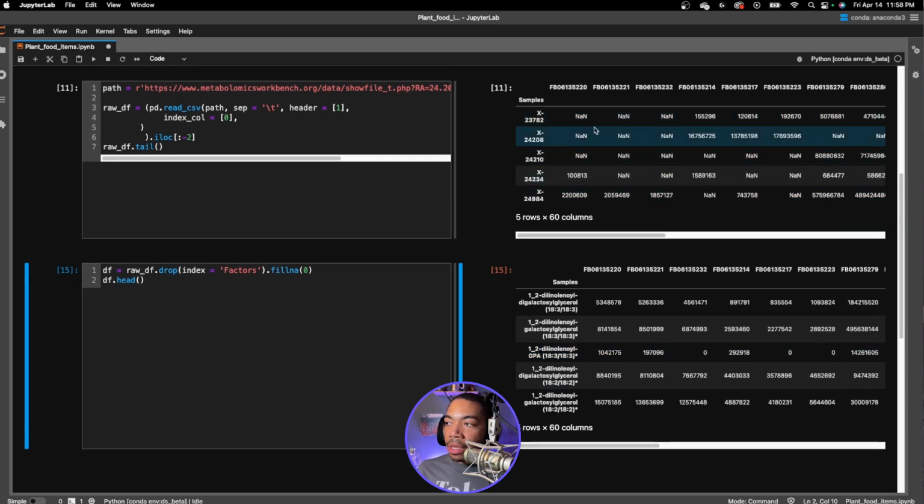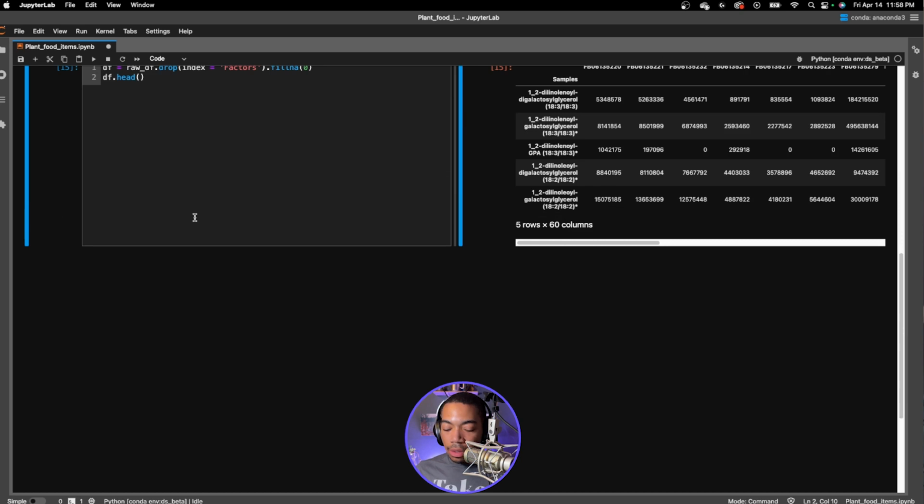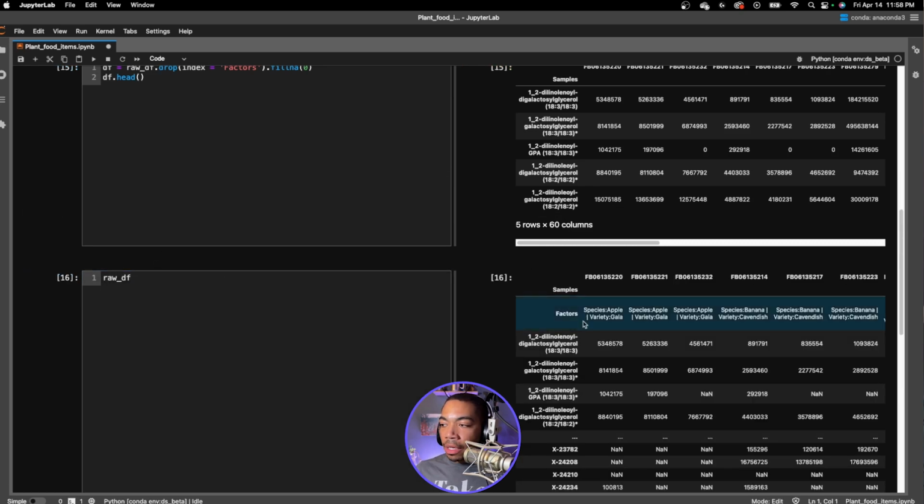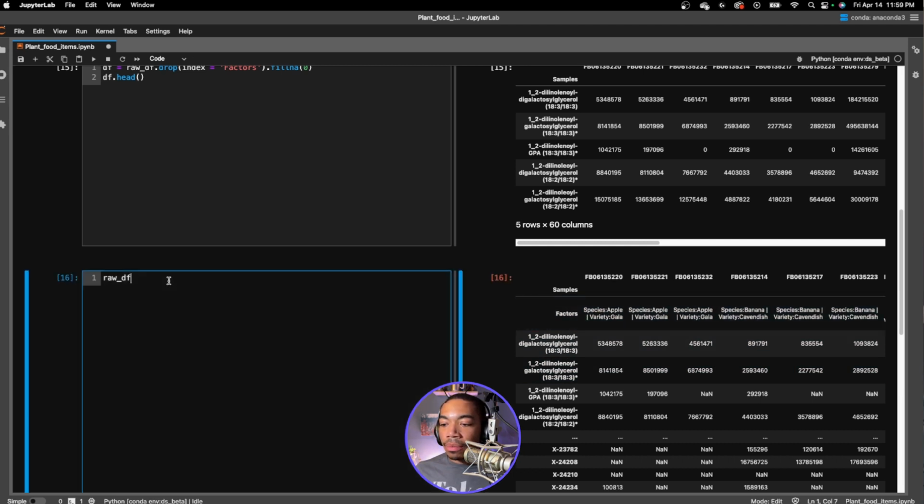Next, I mentioned that there may be a relationship between those header columns and that first row in rawdf. So if we look at these 2 here, let's try to take advantage of that in this step so that we can get rid of these cryptic codes and maybe just state Apple for each of them. When we're going to be doing a lot of data processing, I like to wrap everything in parentheses so that we can see the change as a function of our various methods.